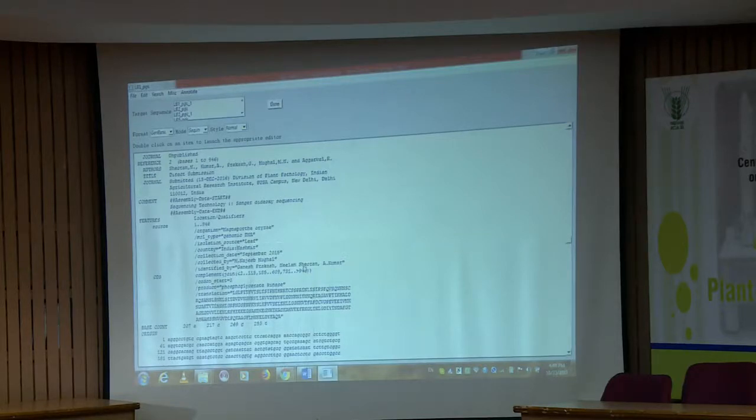Once you specify that, all the stop codons will be eliminated from the sequence, right. In the nucleotide you had seen some stop codons coming in between, because wherever your coding sequence ends, you get one stop codon. Here that has been taken care of and not a single stop codon is visible, since we have mentioned the coordinates of the coding sequence only.